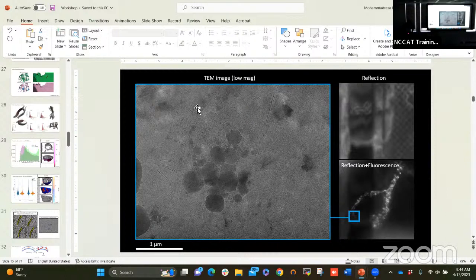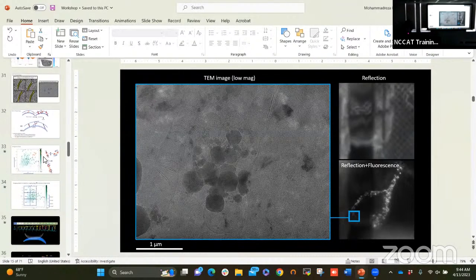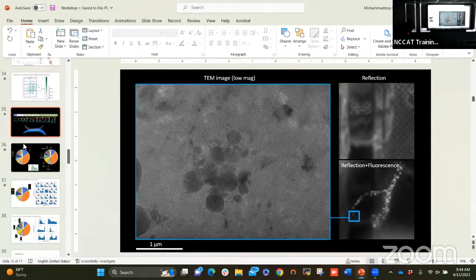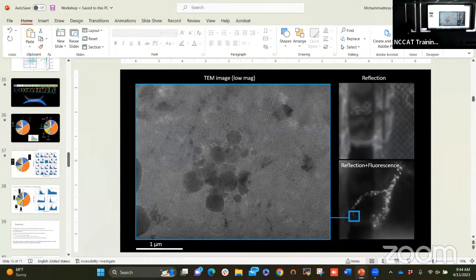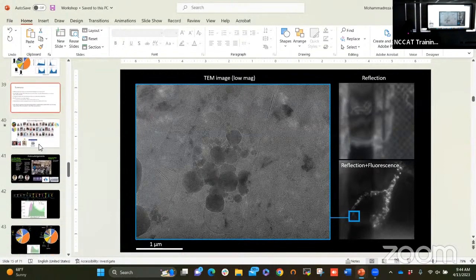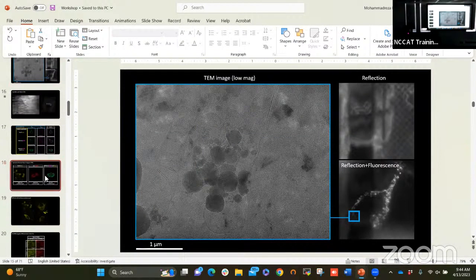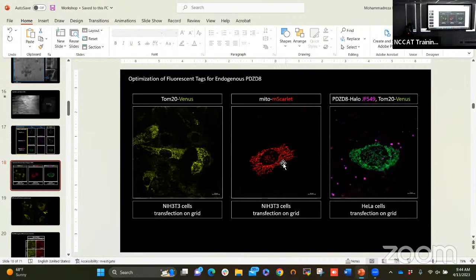I think this is naturally what they look like. They look like long spaghettis that start at the nucleus and go all the way to the edges. When it's round, it's like 10 to 15 microns. But when it attaches and grows out, it looks like an eye. That's a good example of how they start from the nucleus and radiate out.